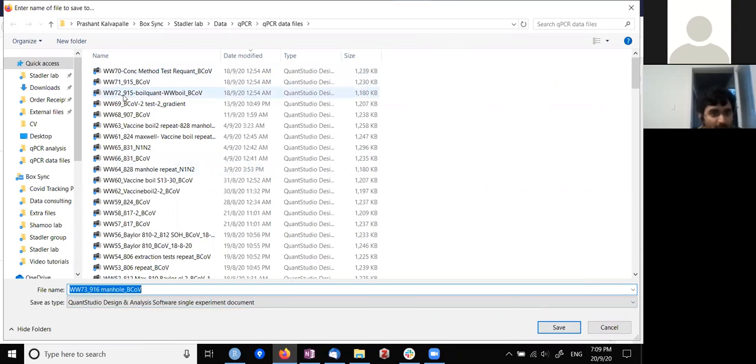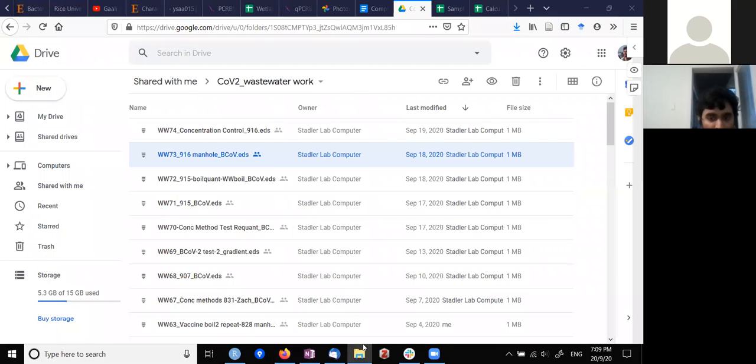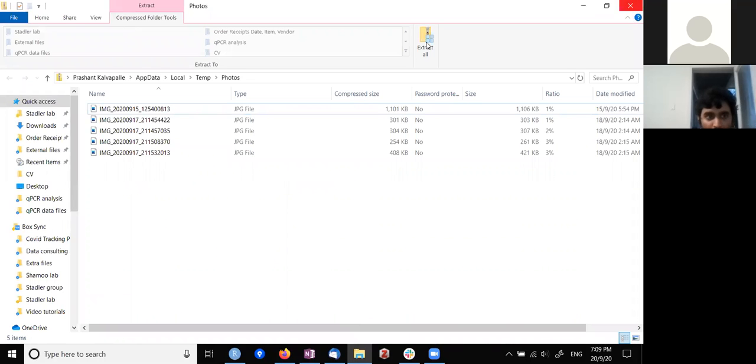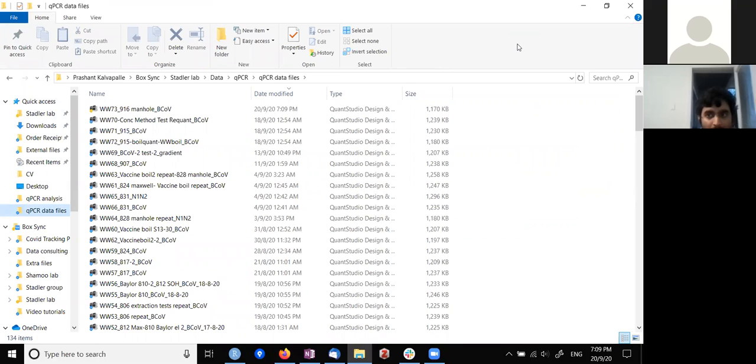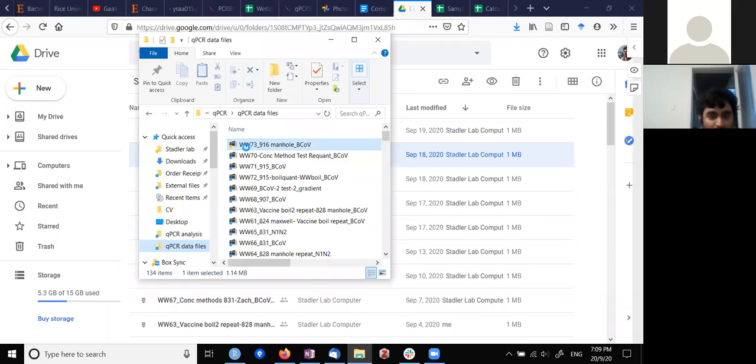My files end at 70, 71, 72, so this is the next one in the series. I'll open this in the proprietary software that they give for free.